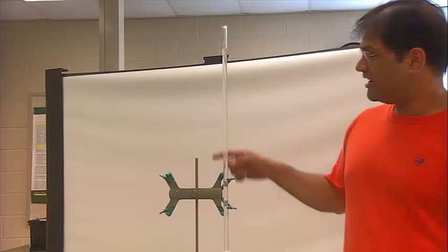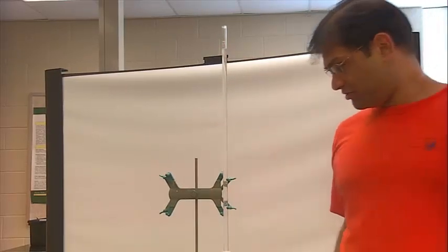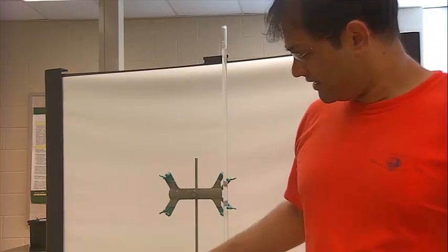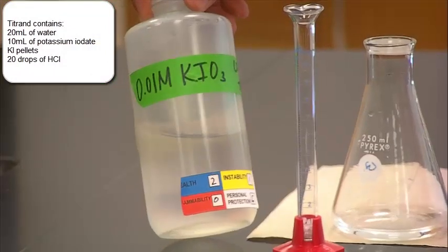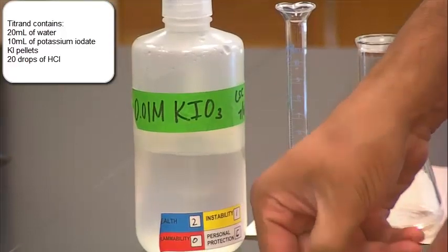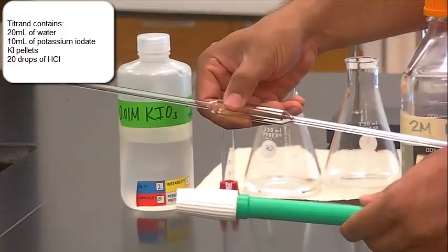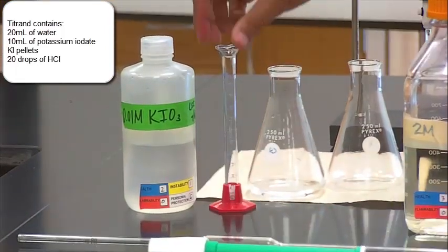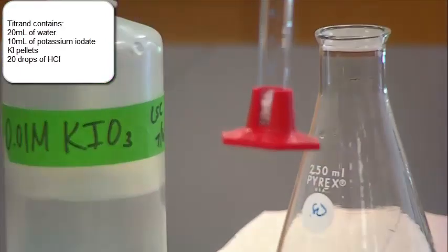In your titrant, you'll have your sodium thiosulfate. Your titrand, the substance that's going to be in your flask, will contain 20 mL of water. It will contain 10 mL of potassium iodate, and that is something you want to pipette, so you want to use an exact volume. For exact volume, you'll use this volumetric pipette. You'll also put into this Erlenmeyer flask a little bit of these potassium iodide pellets.